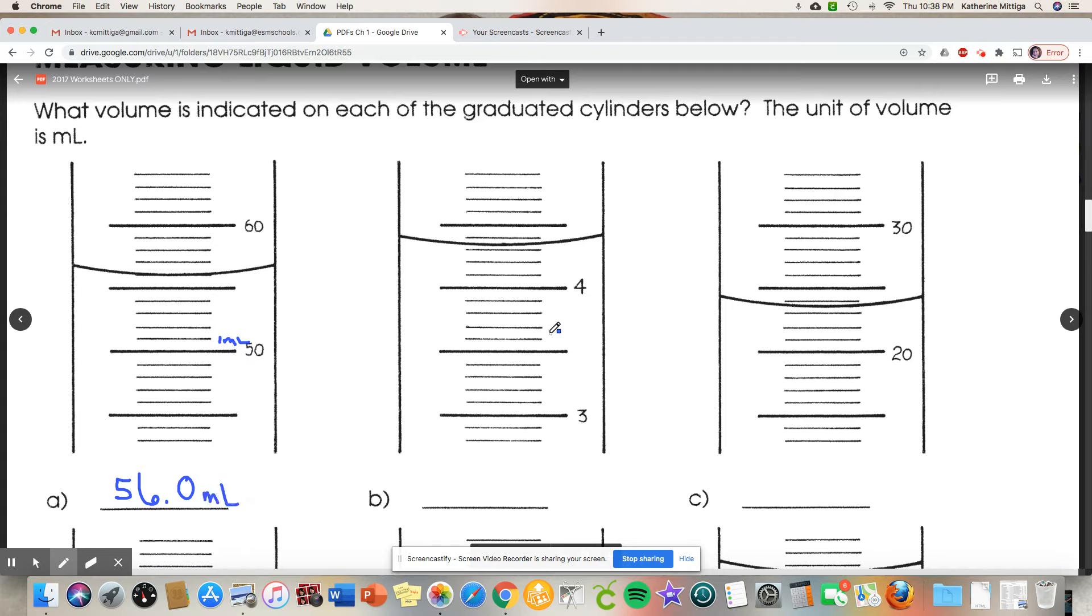In this one it looks like each of these lines are worth one tenth, so this is 4.5. So this is 4.1234, so we definitely know it's 4.3 but it's a little bit beyond. I would say it's right in the middle, so since we know the tenths we estimate the hundredths: 4.35.